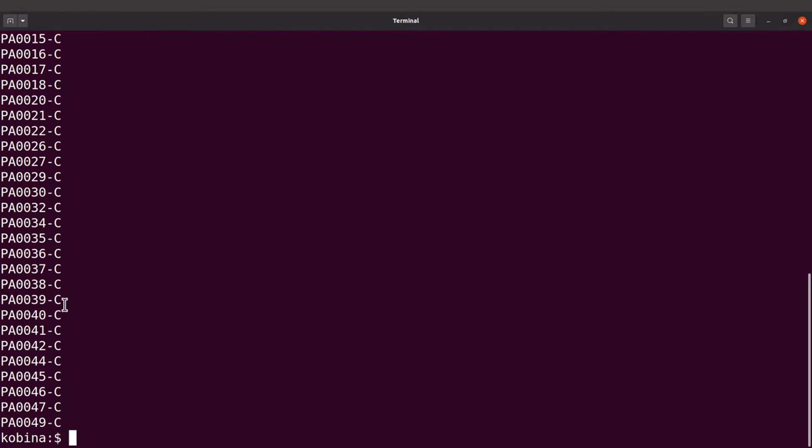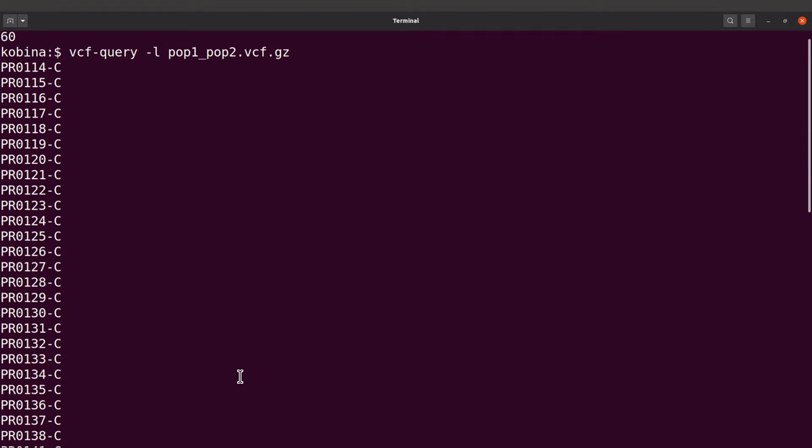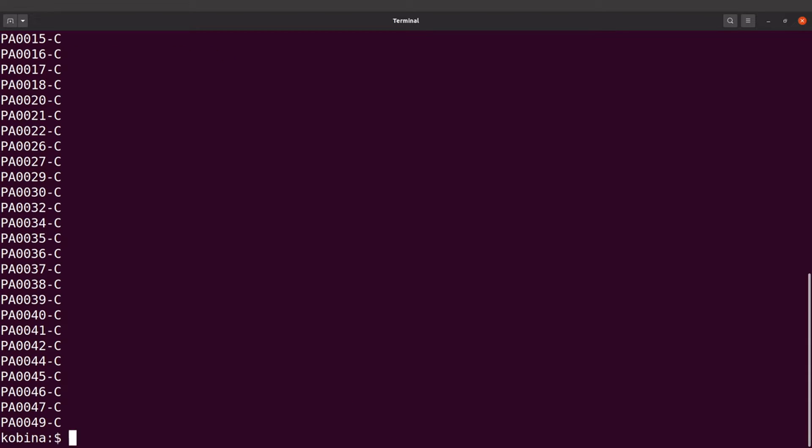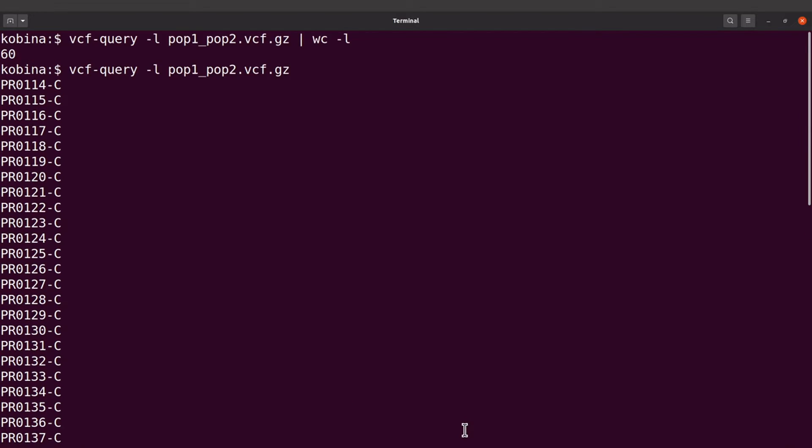So the PR ones are those from Bangladesh and then the PA are those from the Gambia. Okay so if we are going to compute the FST values then we need to have the sample names or the sample IDs. We need to have them in different files.